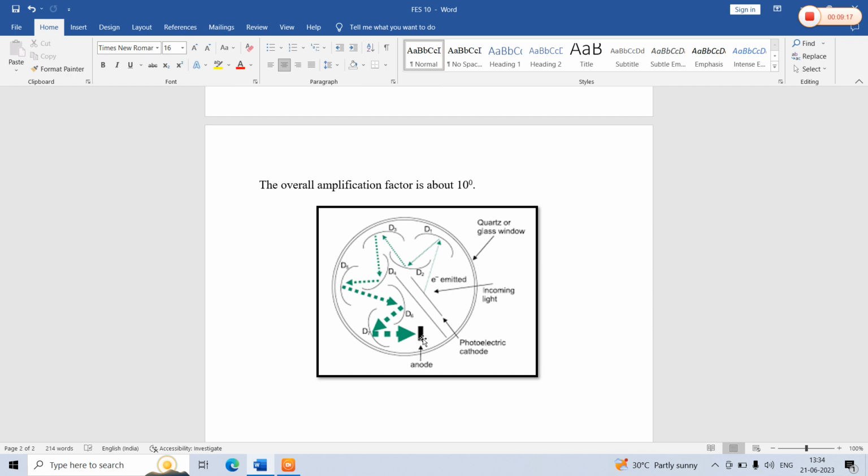So this is all about the photomultiplier detector used in flame photometry. In that chapter we have already learned about the principle, the type of burner used, then there is an entrance slit and an exit slit, and between them a monochromatic system is placed. These three together are also called the optical system of the instrument. After the optical system, the detector is placed, and that detector is nothing but the photomultiplier tube. With this content, I conclude this lecture. Thank you very much for your patience listening.